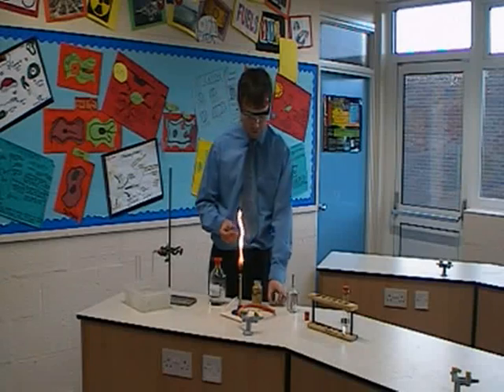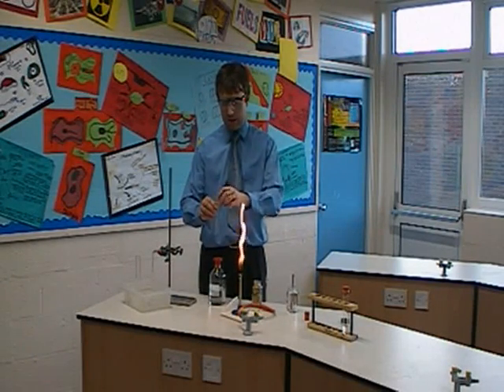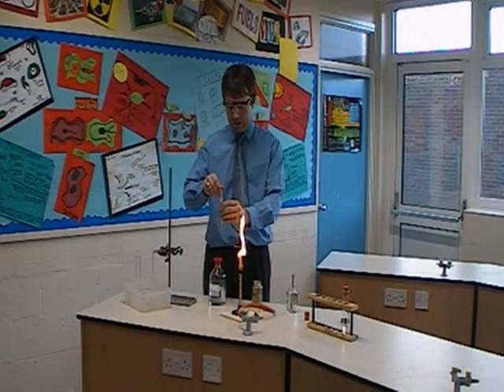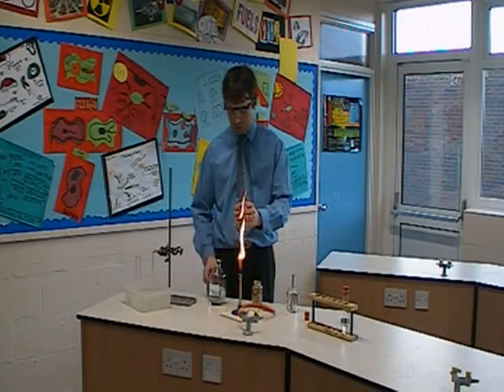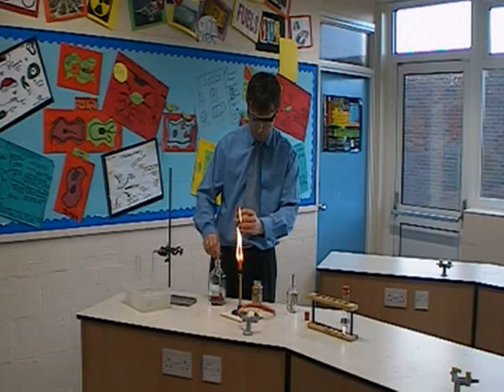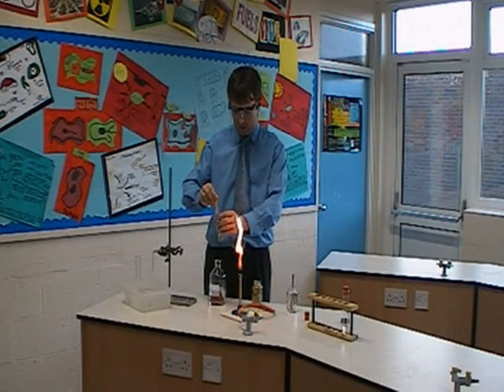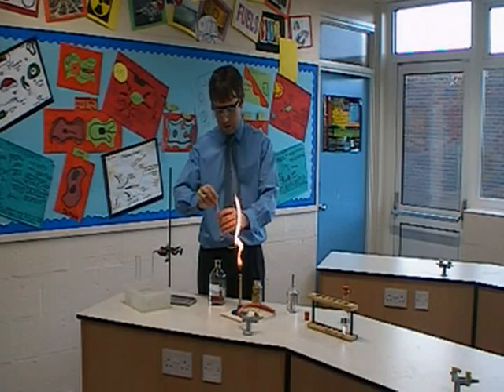To start off with I'm going to put some mineral wool into a test tube. Pop that into the test tube, push it down to the bottom, and then add a few drops of paraffin oil onto the mineral wool so it's soaked up. I'm just adding the paraffin onto the mineral wool so it's nicely soaked in there.